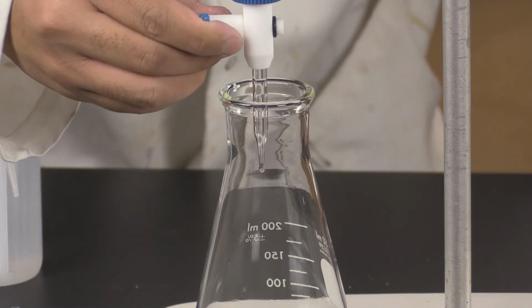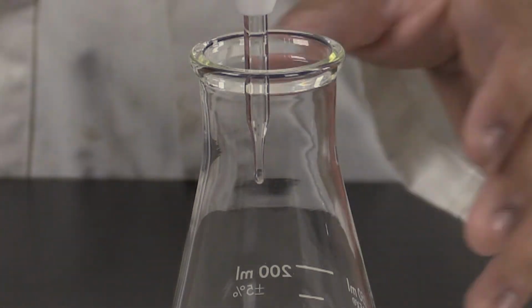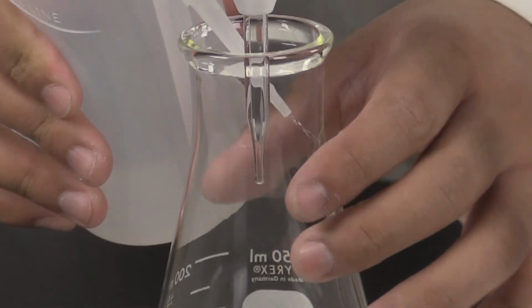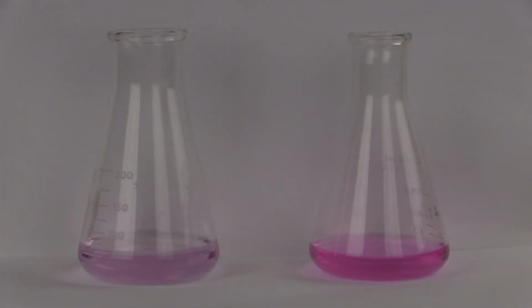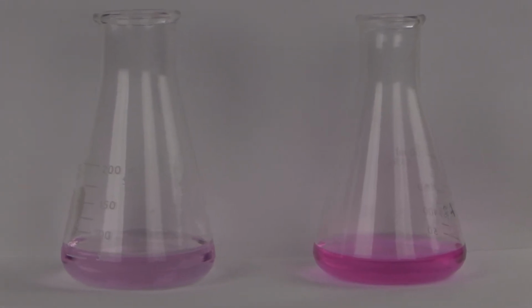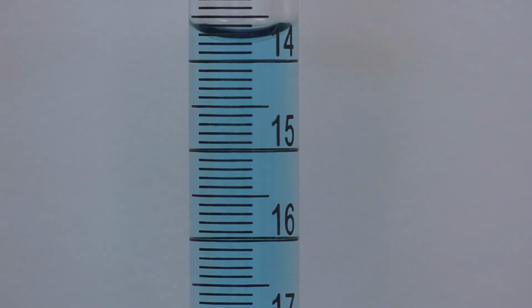You can add less than 1 drop of titrant by carefully opening the stopcock to let a small amount of liquid build up on the tip of the burette. Then touch that tip to the side of the flask and rinse with water. Your titration is finished when the solution changes to a faint, persistent pink. Darker is not better. Let's take the final measurement and do some calculations.